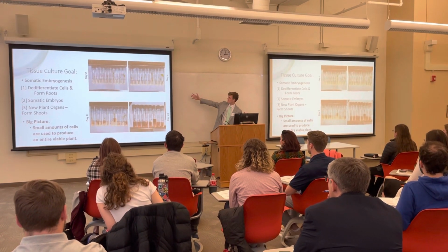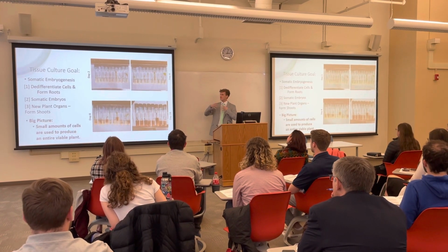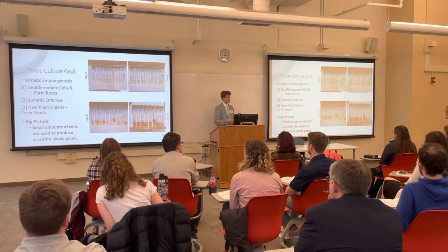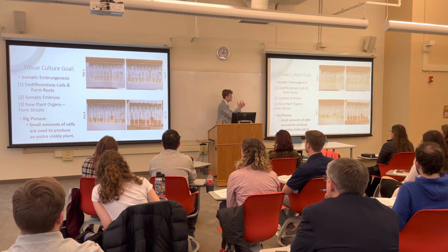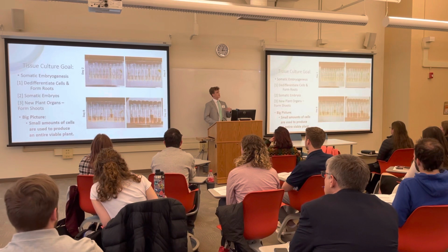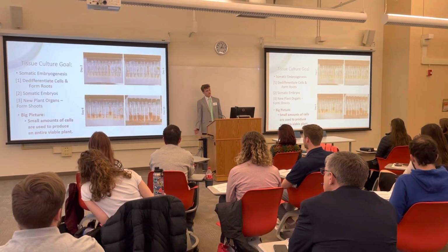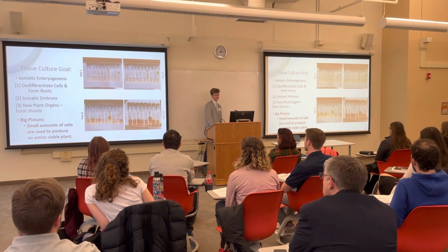The overall goal of plant tissue culture is somatic embryogenesis. What are somatic embryos? They're essentially the things that form new plant organs, new shoots of the plant. So your first goal is going to be to de-differentiate the cells and form essentially what looks like a plant tumor. It's very interesting. It's just undifferentiated cells. And those tumors can form roots, and then you're going to form the somatic embryos, which look like little heart shapes. They're real pretty and cute. And then you're going to form new plant organs, which is the shoots. Big picture here, small amounts of cells are used to provide an entire viable plant.